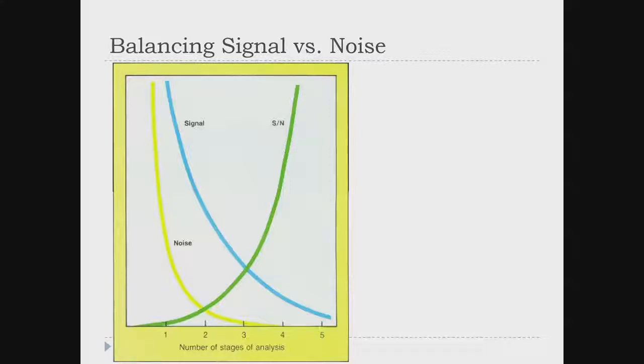It's a basic principle of mass spectrometry, or any analytical chemistry, that if you can decrease noise faster than you decrease signal, then your signal to noise goes up, and that's going to increase your sensitivity. So don't let people tell you that sensitivity is just dependent on the number of ions. It's also dependent on the selectivity and the level to which you can measure the right ions.